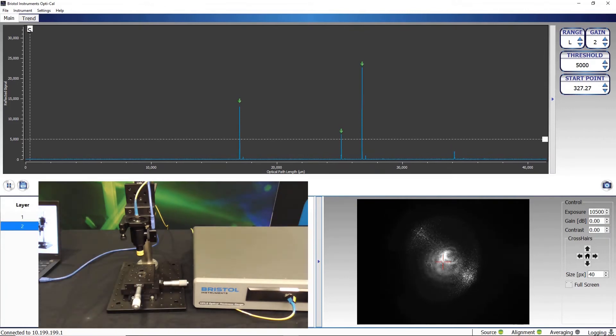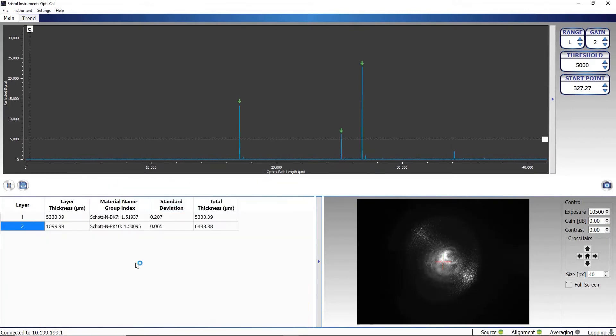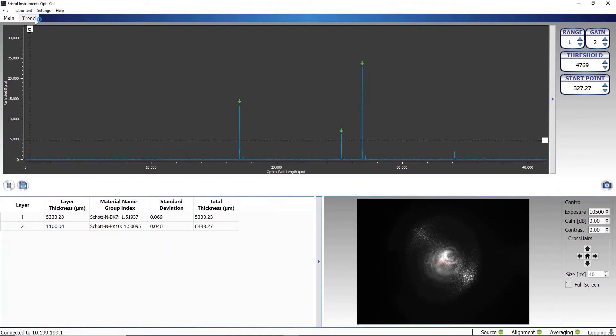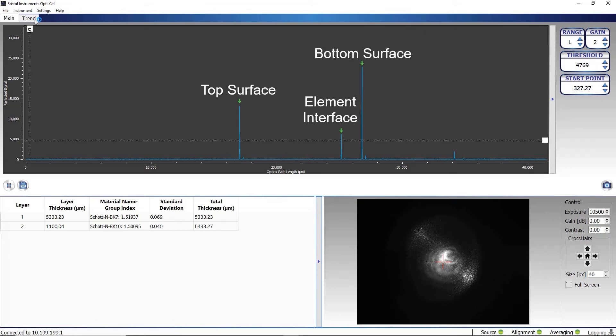Now, the Bristol Instruments optical thickness gauge is measuring the center thickness of the doublet. The first peak represents reflection from the top surface of the doublet. The second peak is the element interface, and the last peak is the bottom surface of the doublet.